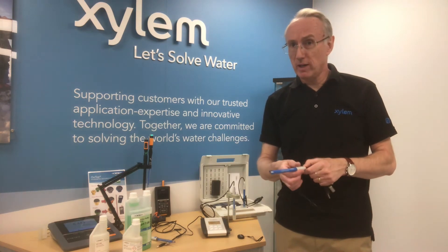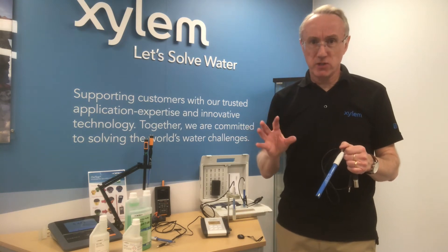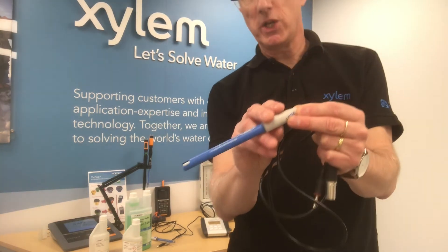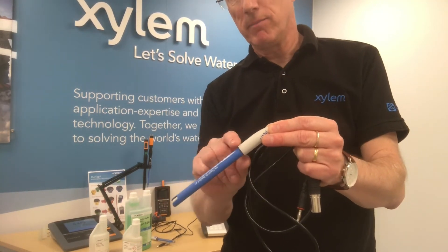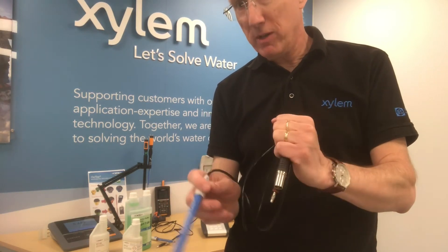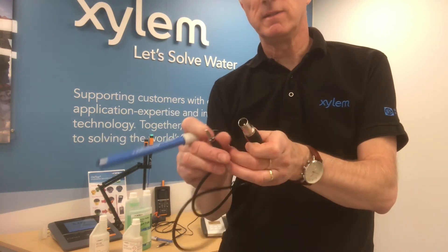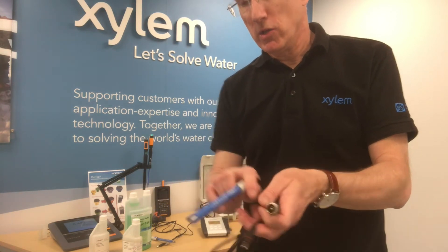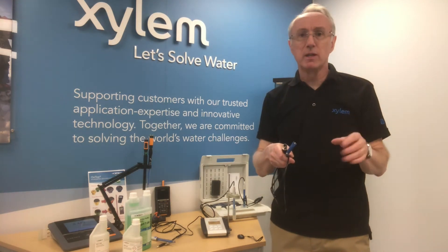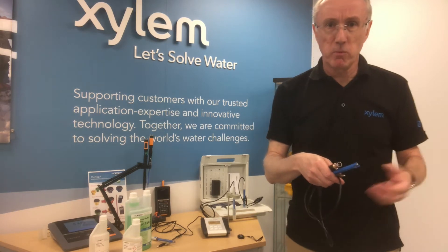There are two main types of probe — there are others for specialist applications, but the main two are a gel probe or gel-and-plastic. That means it has a plastic body, a gel three-molar KCl electrolyte inside, and it's a combined pH and temperature sensor. We have a DIN connector here and a banana connector for the temperature. Gel probes are easy to look after, robust, and fairly low cost, so they tend to be the option many people go for.